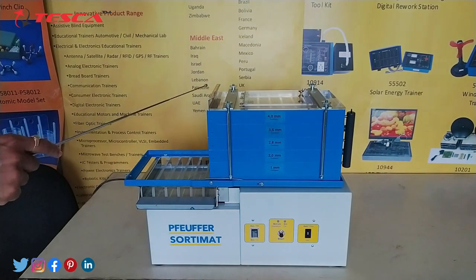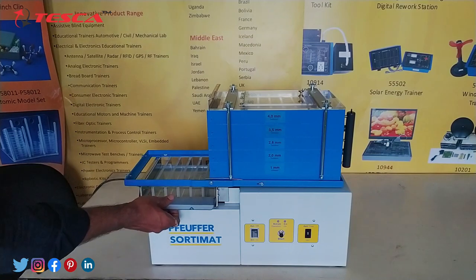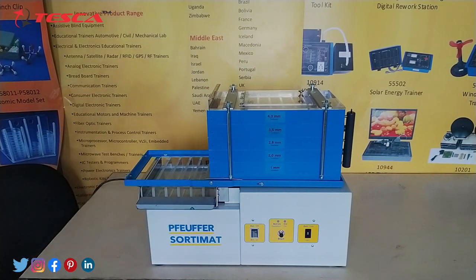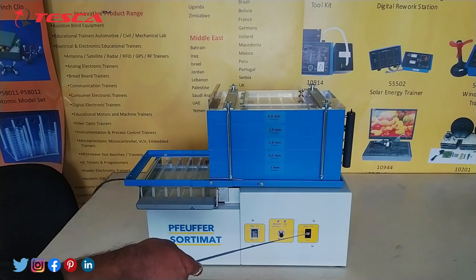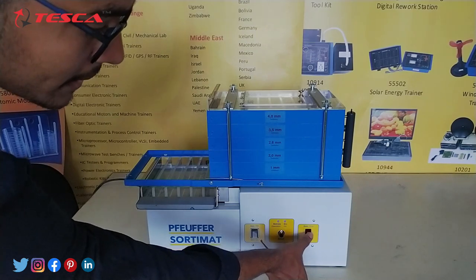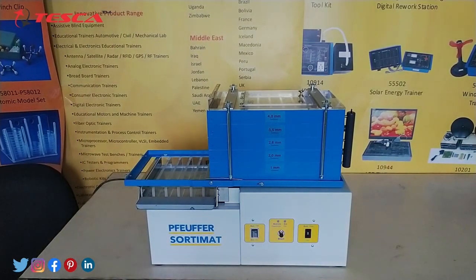This is the slide, and this is the drawer with collecting trays. We can remove this drawer and place it back in its place. Then this is the main supply switch, this is the start button, and this is the coding switch, which is used to adjust the time. When we press the lower button the time increases, and when we press the upper button the time decreases.